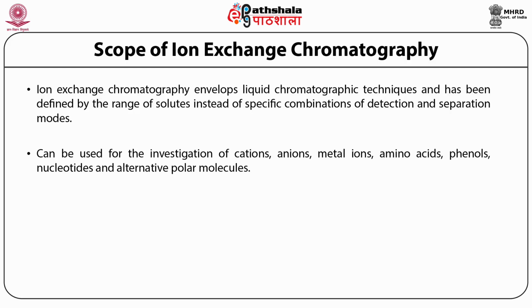Immense applicability, including low cost, tremendous performance, influential resolving ability, huge sample handling capacity, and easy scale up along with automation, has made ion exchange chromatography one of the most significant and broadly used among all liquid chromatographic techniques.